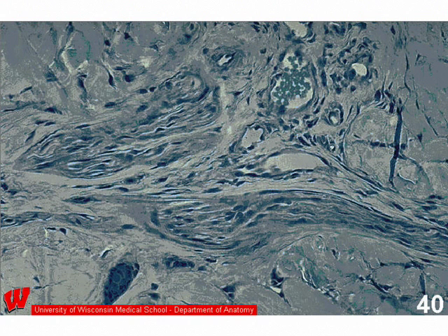and because there is no lumen, it is not an epithelium. So by a process of elimination of the 4 different cell types, what we're seeing here is a peripheral nerve bundle, probably out in a place such as the hand or the forearm, and it's running in dense connective tissue. What are all of these individual nuclei that are inside the peripheral nerve bundle? These are the myelinating cells called Schwann cells that wrap plasma membranes around axons as they travel to their destination.